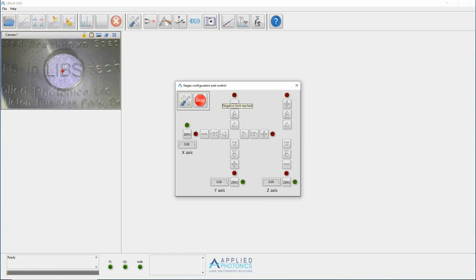The parameter values currently displayed in the stage's configuration window will be saved to the libsoft configuration file when the application is shut down, and automatically reloaded the next time the application is started.